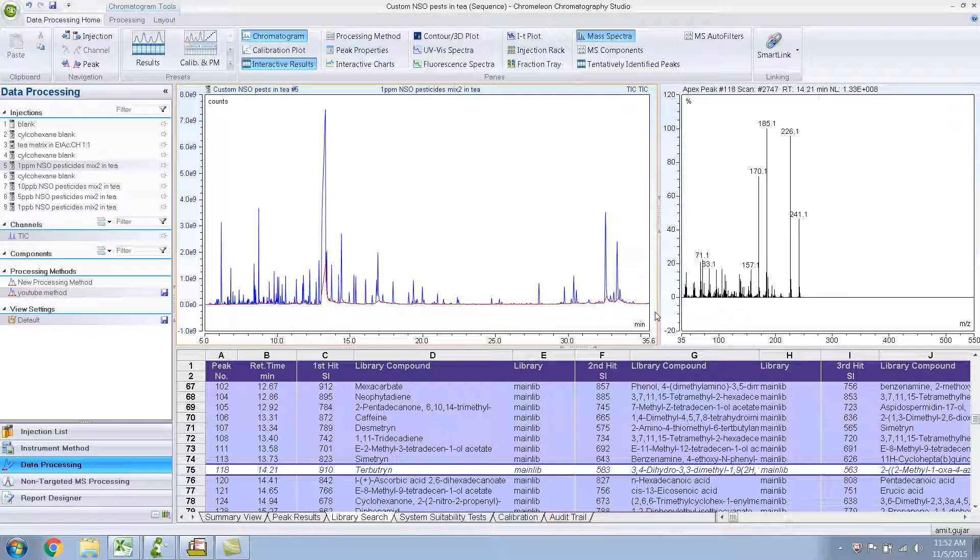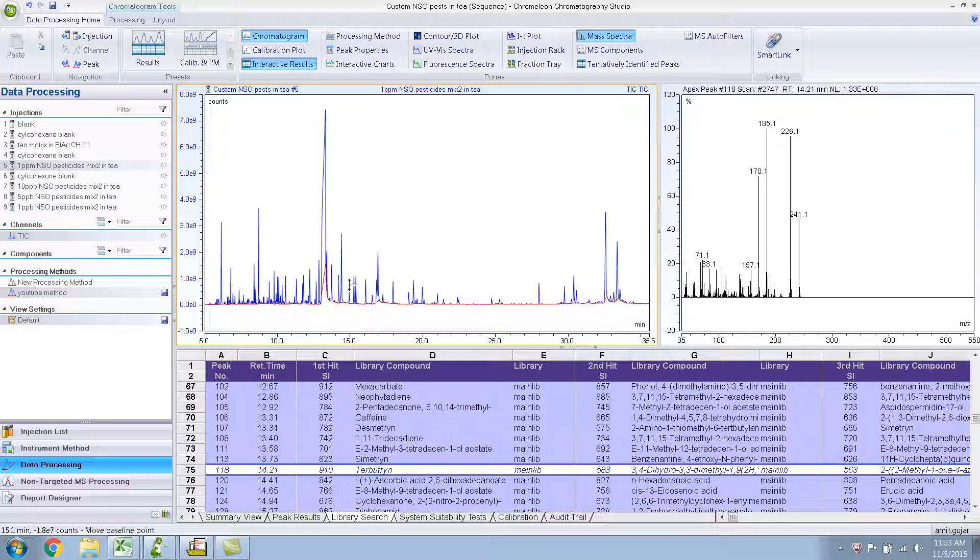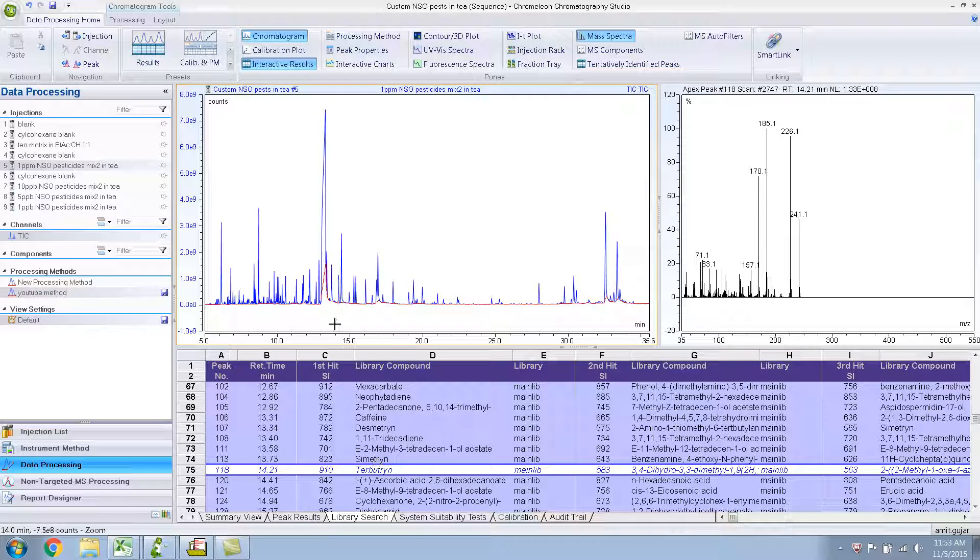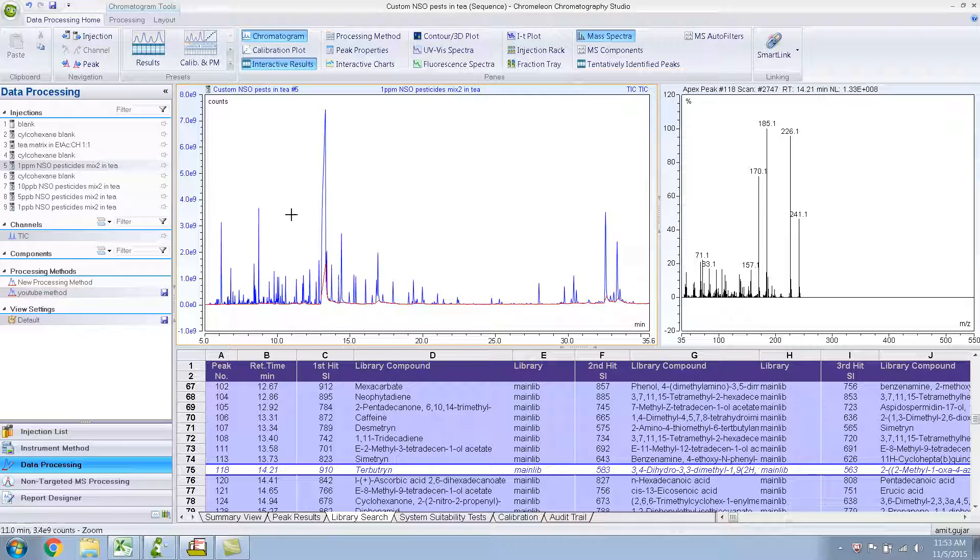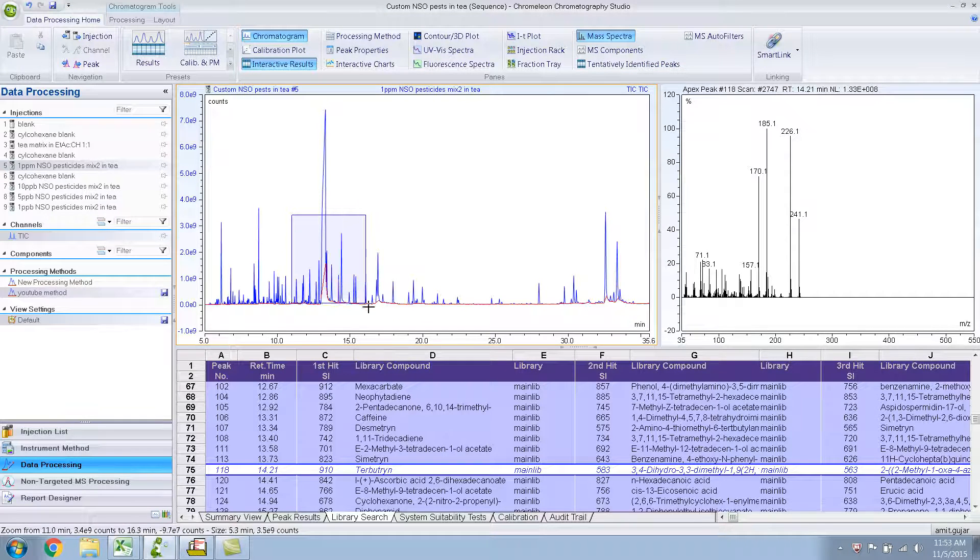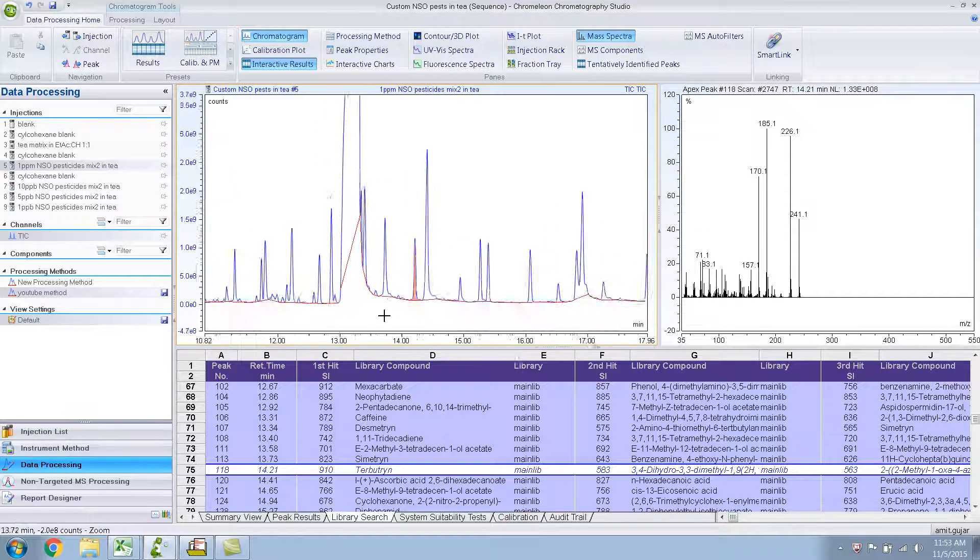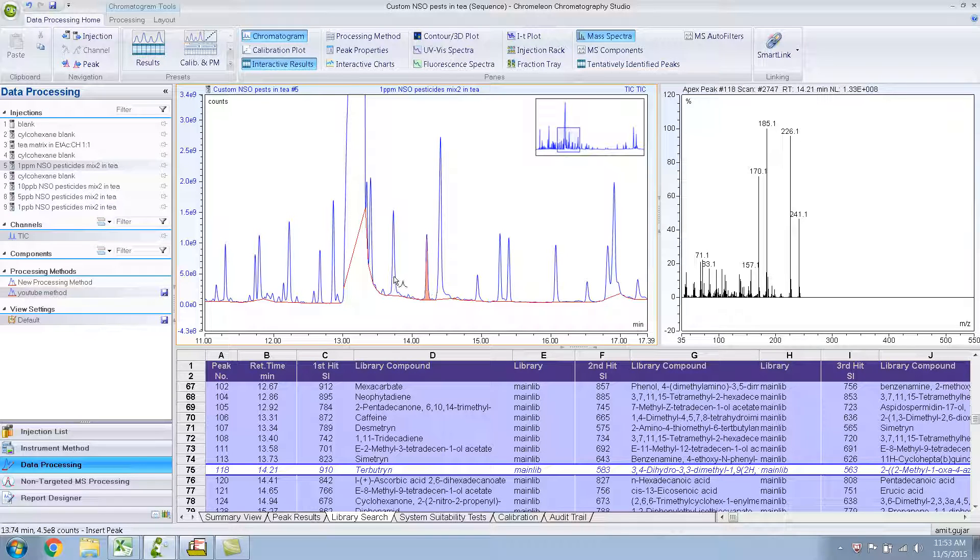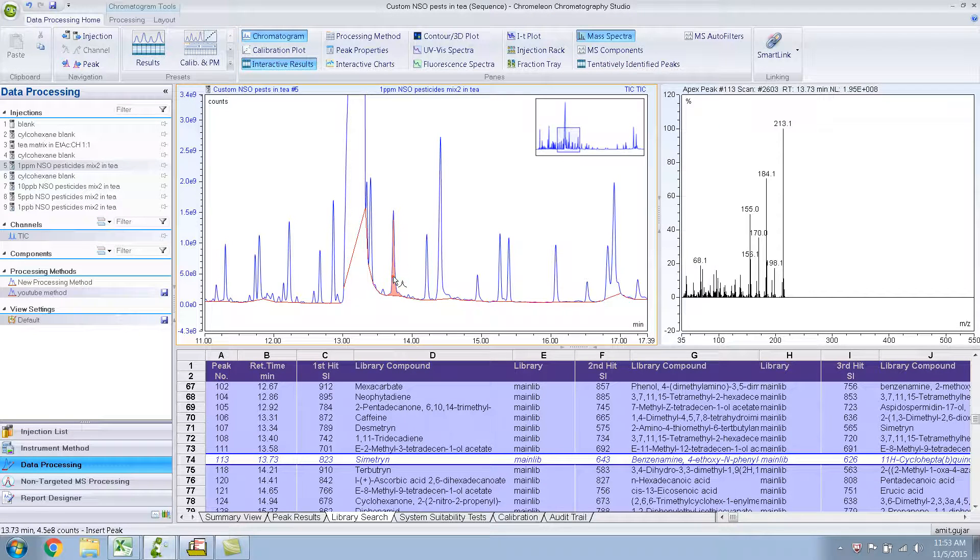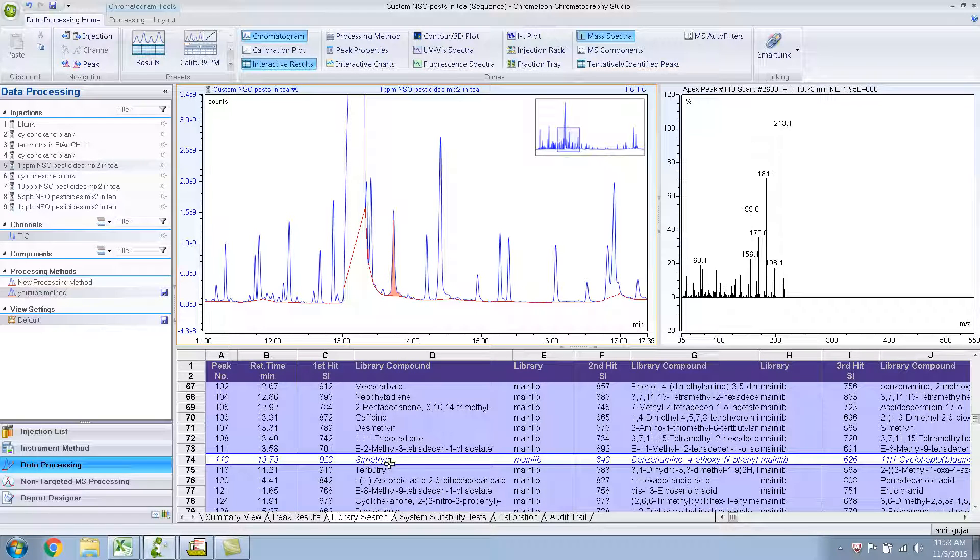In part 1, I showed you how to create a processing method for this sequence and how to do library searches. Now let me show you something more. Say this particular compound, Terbutrin, which is the one which I've selected over here. If I select this one, the Symetron highlights over here in the Interactor Results.